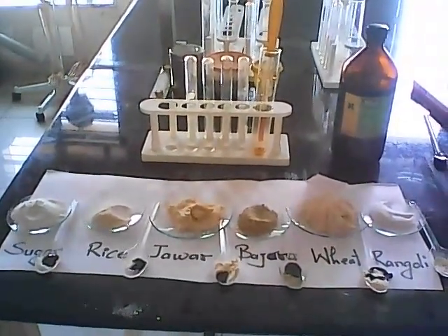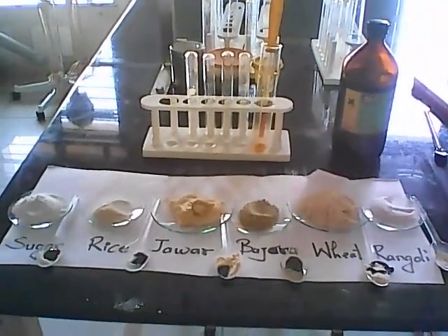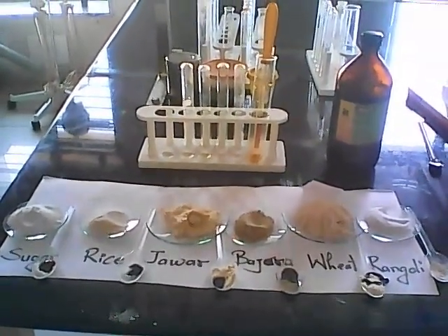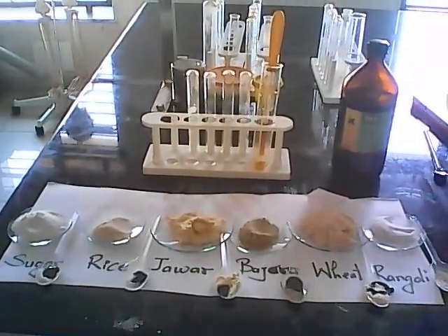Therefore, this practical is concluded with the statement: sugar, rice, jawar, bajra contains carbohydrate, whereas rangoli does not contain carbohydrate in it.